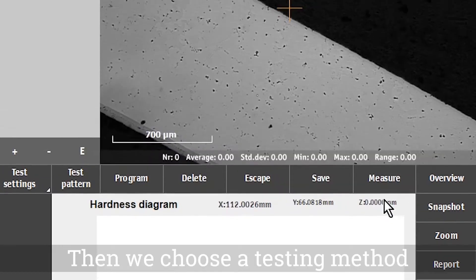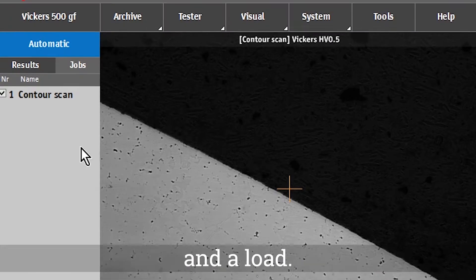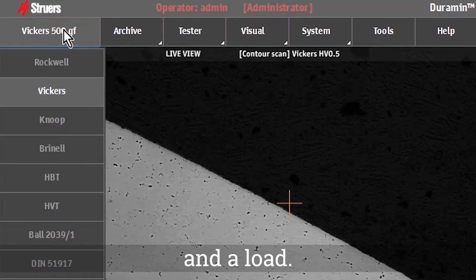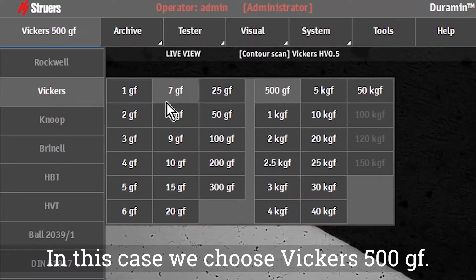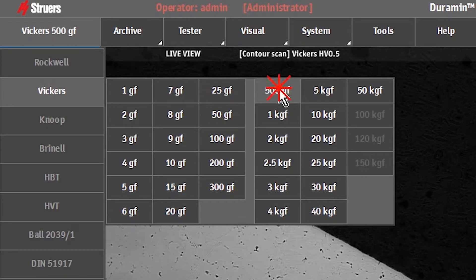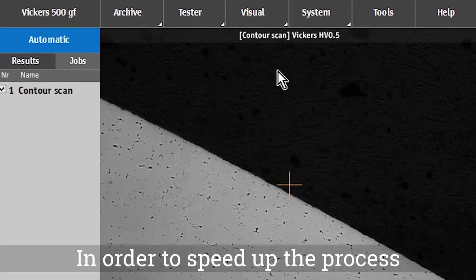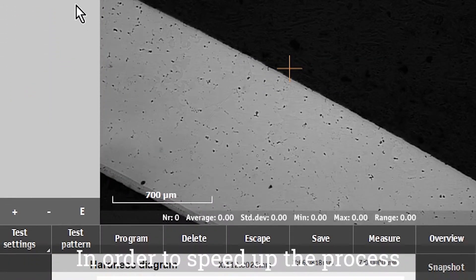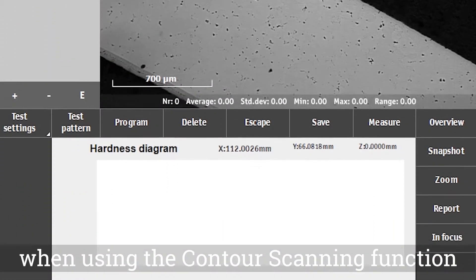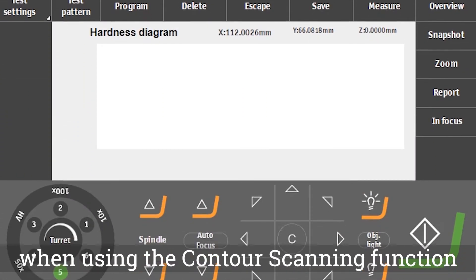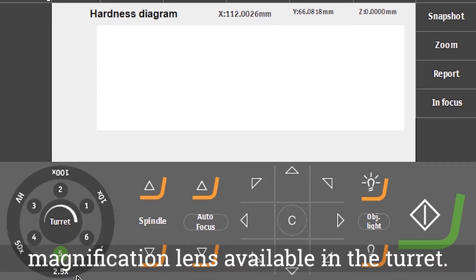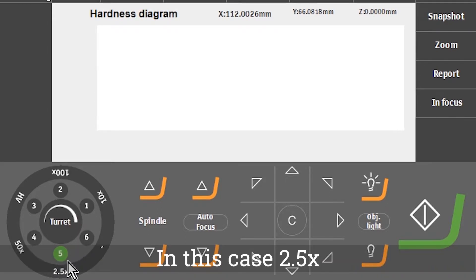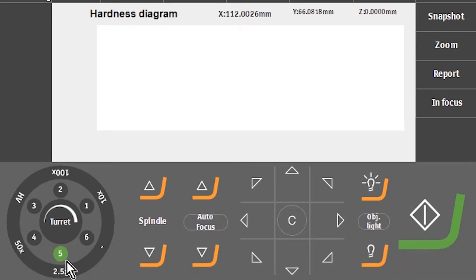Then we choose a testing method and a load. In this case we choose Vickers 500 gram force. In order to speed up the process when using the contour scanning function, it's important to select the smallest magnification lens available in the turret. In this case 2.5 times.